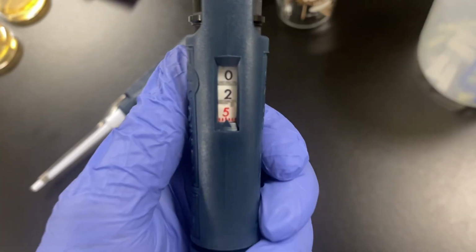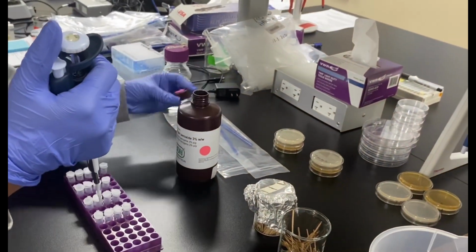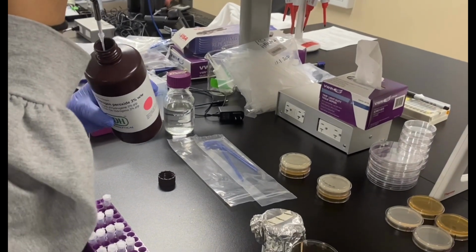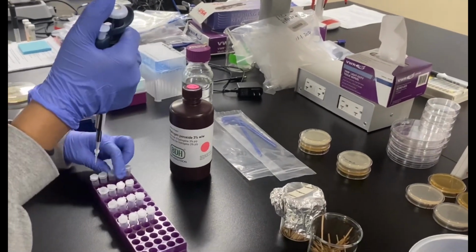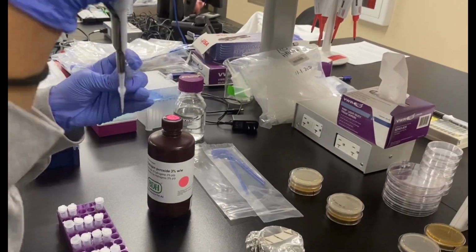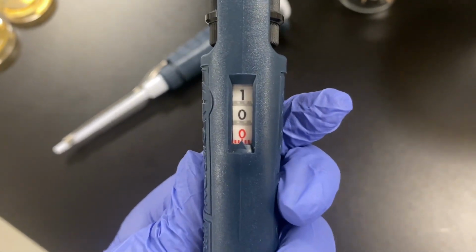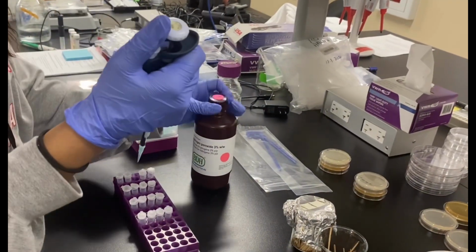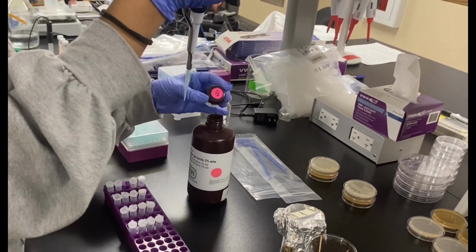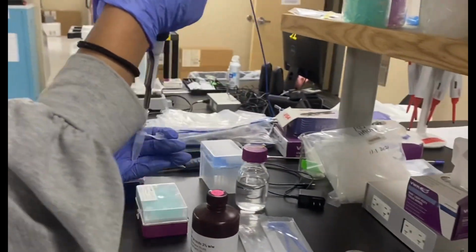Next, adjust the P20 micropipette to 025, which will allow you to get 2.5 microliters of solution. Attach a fresh pipette tip and add 2.5 microliters of hydrogen peroxide into tube HP1. Vortex to mix the cells. Next, adjust that P20 micropipette to 100, which will allow you to get 10 microliters of solution. Attach a fresh pipette tip and add 10 microliters of hydrogen peroxide into tube HP2. Vortex to mix the cells.